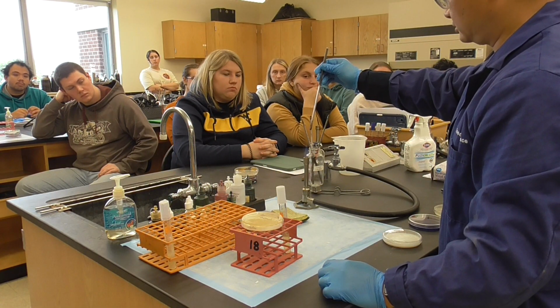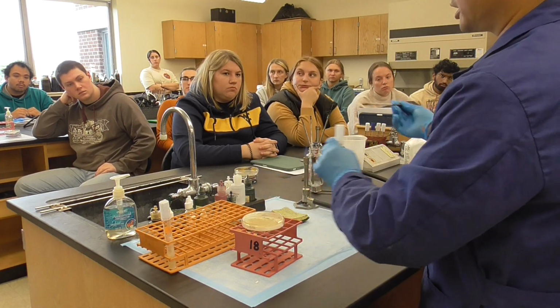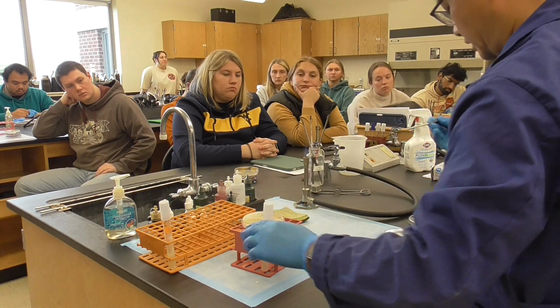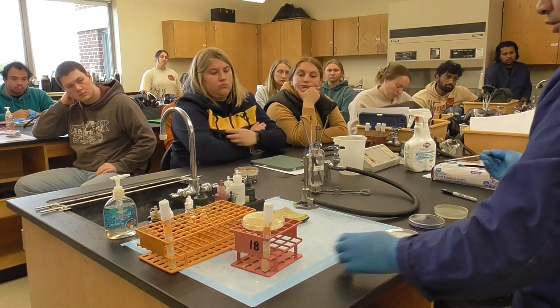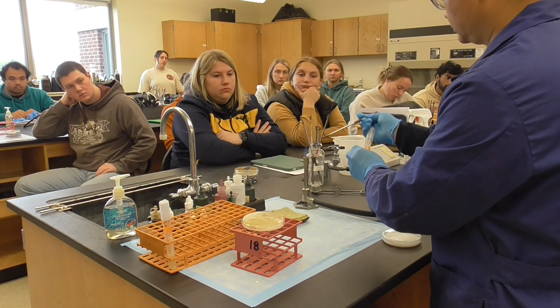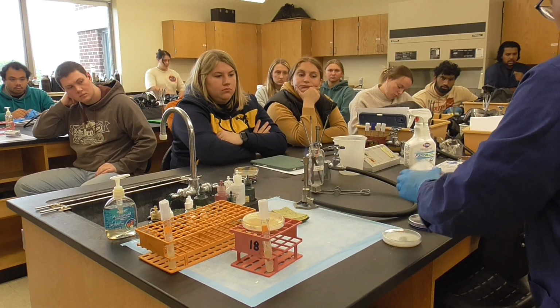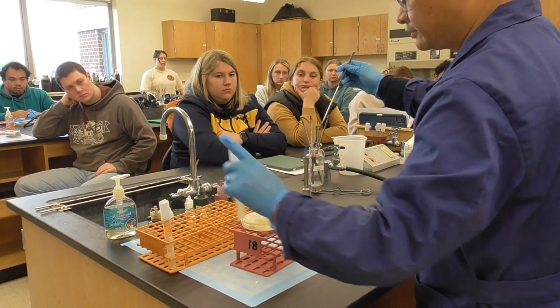Second one, Bacillus. What are the two plates for Bacillus? The starch agar and the milk agar. Okay, Bacillus. Go down, get the Bacillus, and on this side we streak right here. Flame the loop to sterilize. Touch the bacteria, and then in here we do it. That's all. Very gentle.